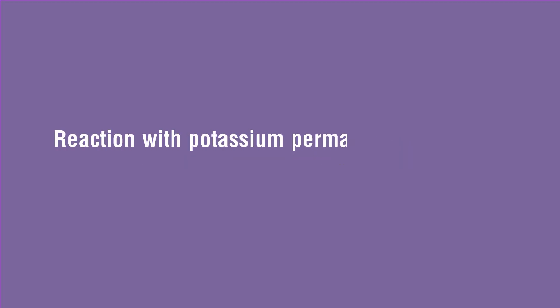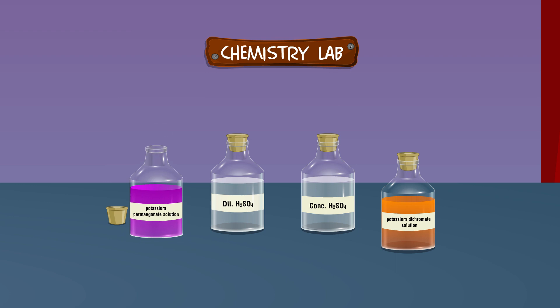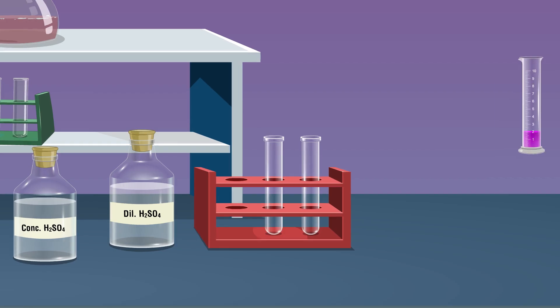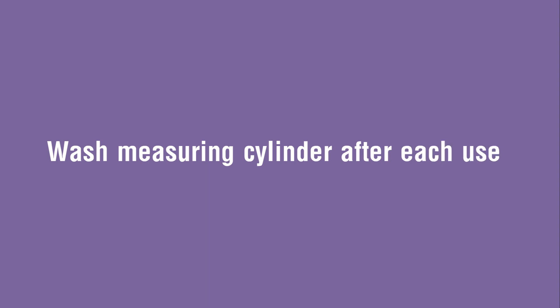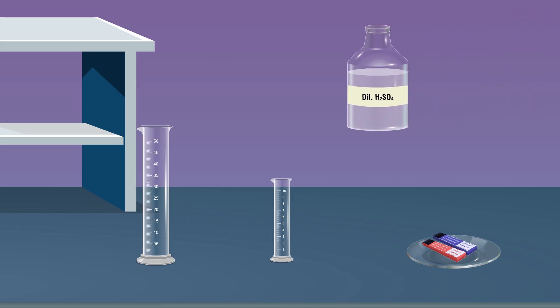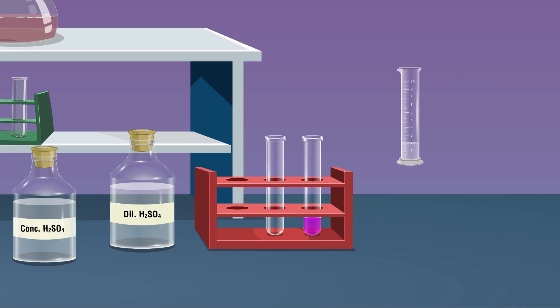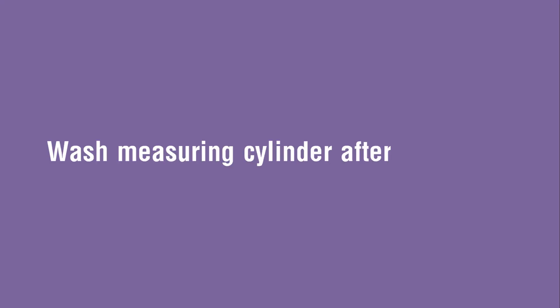Reaction with potassium permanganate solution and potassium dichromate solution. Take 2 ml of potassium permanganate solution in a measuring cylinder and pour it into a test tube. Wash the measuring cylinder after each use. Take 1 ml of dilute sulfuric acid in the measuring cylinder and pour it into the test tube containing the potassium permanganate solution.